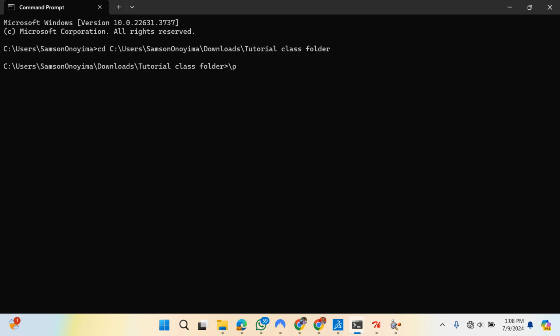So I took that folder to your local disk, where precisely your local disk x86. That is where your software is installed. If you install any software, it goes to your local disk. So I simply took the same file folder to that same directory, so that when you come here, you can simply trace it from the path and get it there.